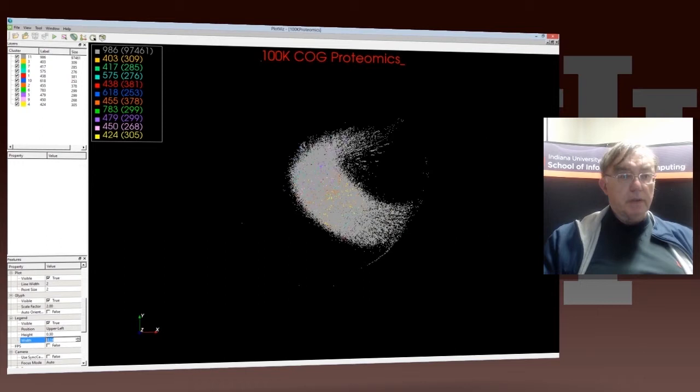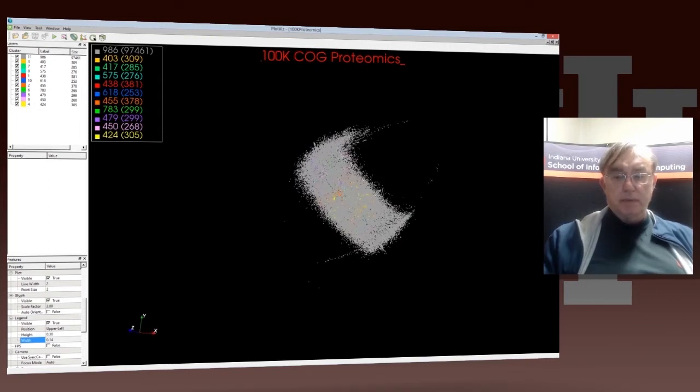So here's what we have. We have ten specified clusters, which have a modest number of points, a couple of thousand. And then we have most of the points are in this so-called default cluster. Well, that's why, and that's, mainly things are gray. That's because they're mainly in the default cluster. So let's get this whole plot arrayed.